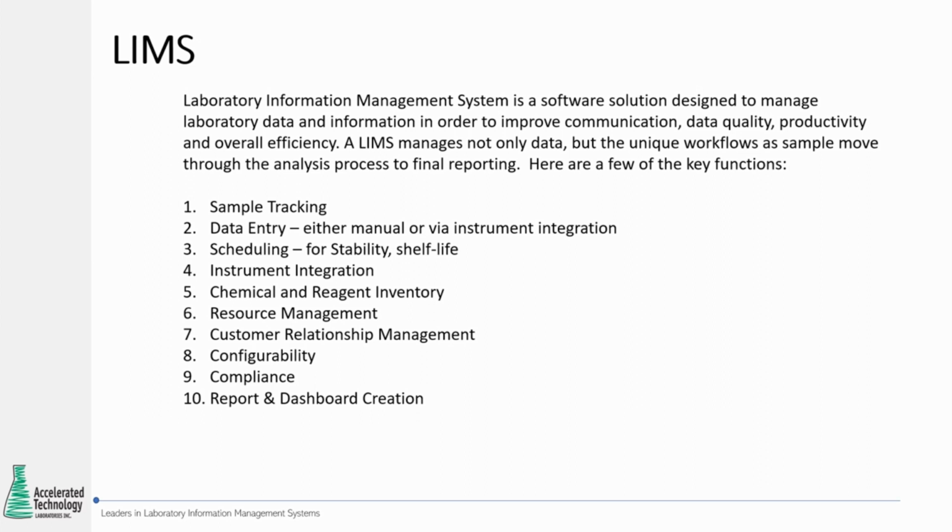And again, rather than keeping all this information in your head or in Excel or on Post-it notes, this can all be put into the system, and then the system can remind the users what needs to be done when. Instrument integration is a huge advantage of having a LIMS, because again, not only does it save time and money, but it also accelerates the time for final result to be delivered. It just makes sense. So today we don't do LIMS implementations that don't involve instrument integration.